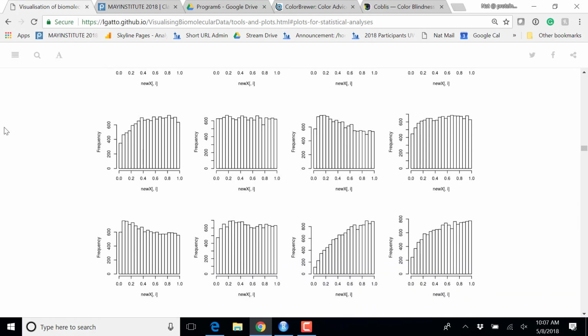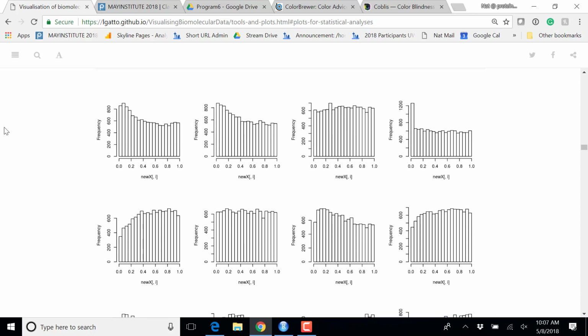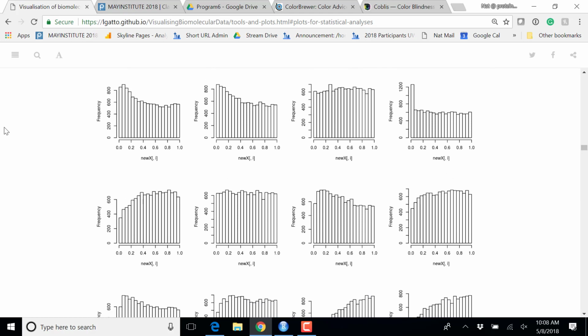These ones are a little bit weird, but this just happens. I resampled my data. Yes. So the one top right here, this is the original data set. So without calculating any enrichment score for small p-values, we can do something like that and make sure that this plot sticks out. So this could also be an interesting exercise if you want to try this out, to regenerate different plots and compare them.